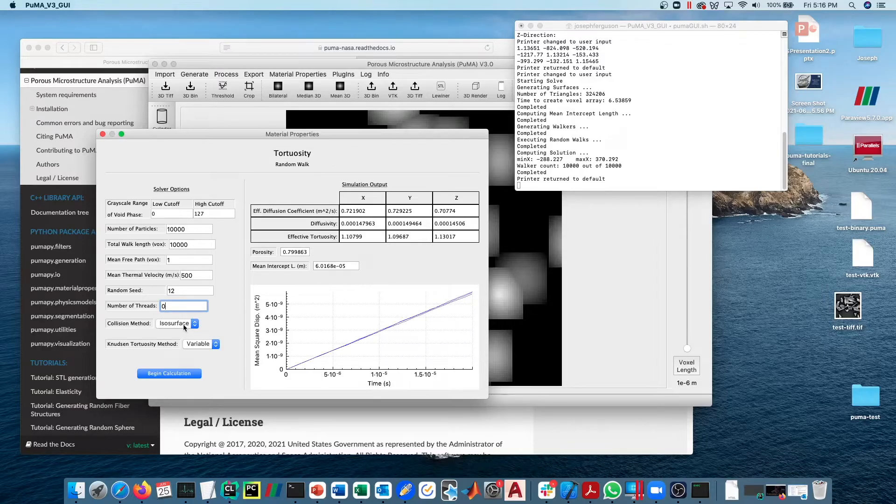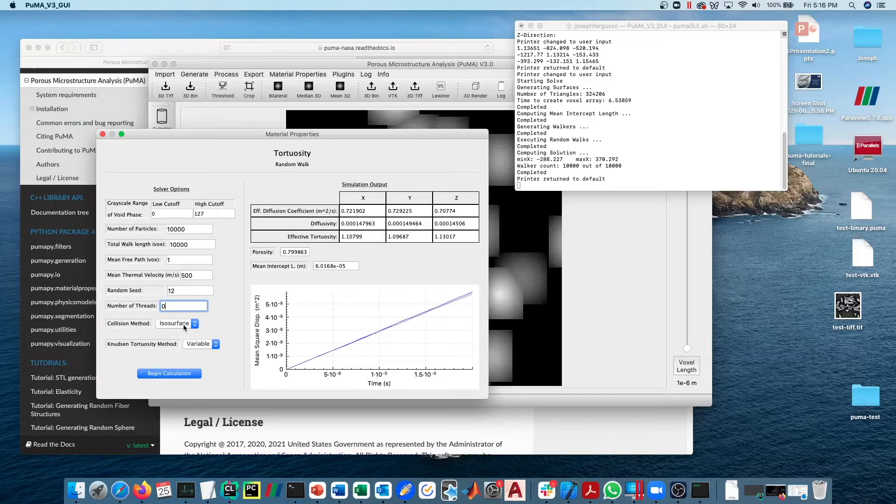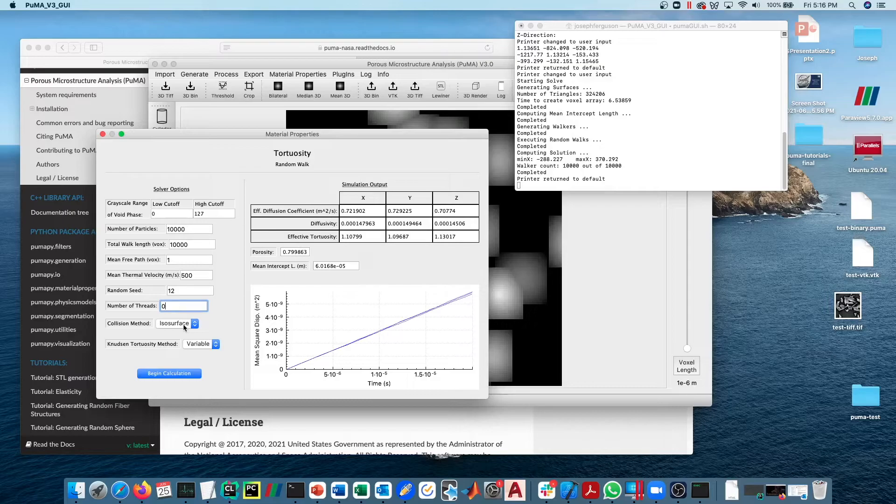The second is the fact that we're dealing with a very small sample size here. If you were to run this on a much larger sample size that is a representative volume, then the differences between the two methods would kind of average out and you would expect to see values that are very close to each other.